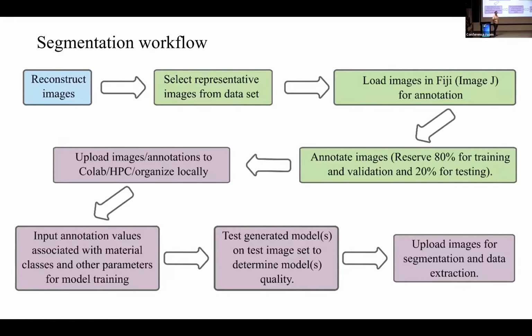And you can use those to annotate your images. You can actually draw in what you want to see. And anytime we annotate our images to train a deep learning model, we want to keep 80% for training and then hold back about 20% for testing. You always want to have an independent test set to evaluate the validity of your models.